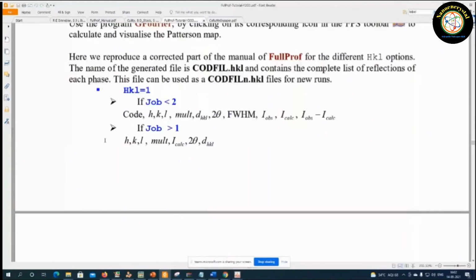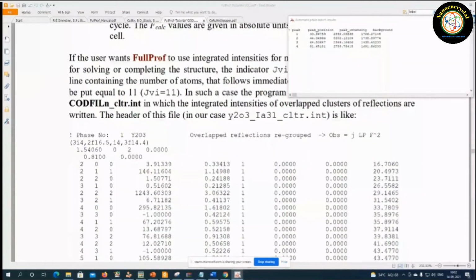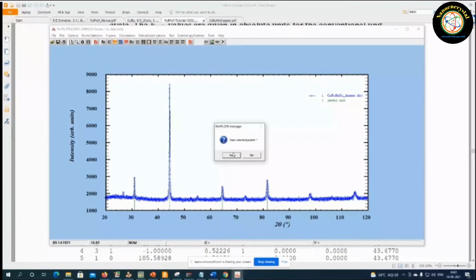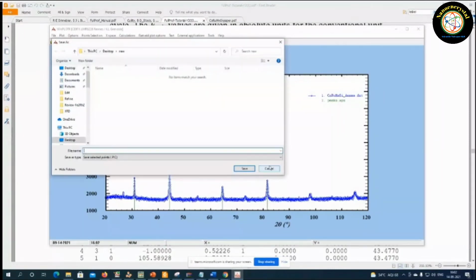Okay, so finally once we get the refinement, it is our duty to give what we got to the publisher. So I am going to that one. Let me produce the required output files. Let me change it to the old working directory.